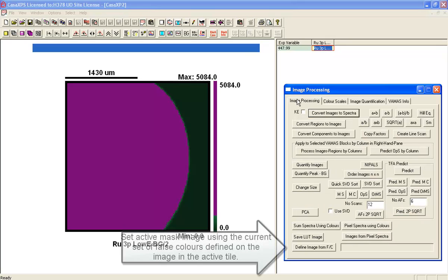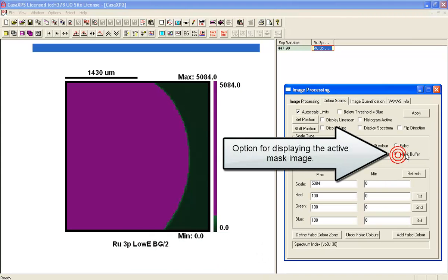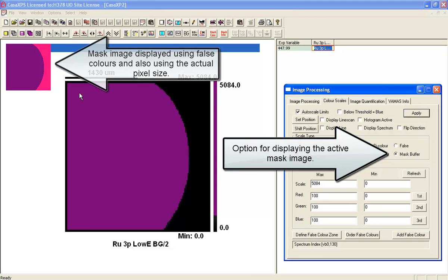What we are going to do now is define this image. So this is the image mask. And if you go back to the color scale, you can see the mask buffer. So we can check that the mask buffer has been loaded.